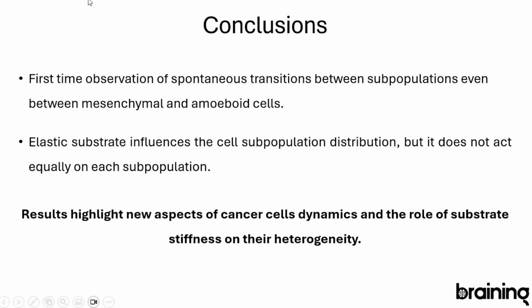And these results can give us new insight into the dynamics of the cancer cells, because we know that the cancer cells are pretty heterogeneous, and the role of the mechanical properties of the environment on the heterogeneity of the cancer cells may have a pretty big influence on new therapies of cancer cells.